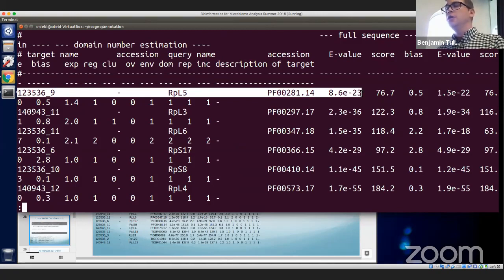So the e-value here is a similar metric to the one from BLAST, but doesn't have the same exact meaning. So you can look at them, and if you know what an e-value in BLAST means, you know what an e-value in your HMM output means, but they're not 100% directly comparable. So an HMM value of -20 and a BLAST e-value of -20, while you know what that means, you don't say one's better than the other. They're just calculated in a similar way. We get some extra scores. It breaks it down based off of the full sequence and the best domain match. And there's some more information that you can look up here.